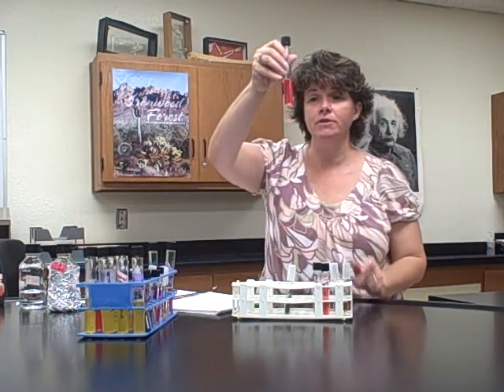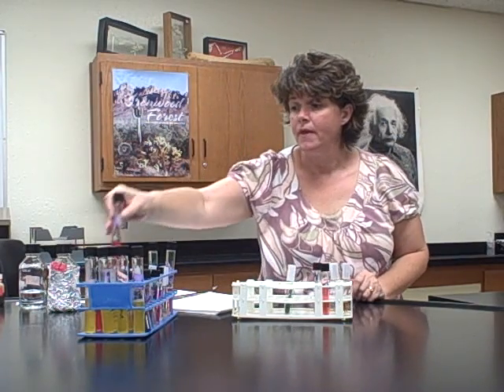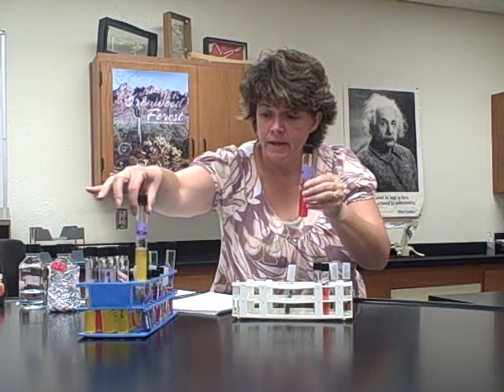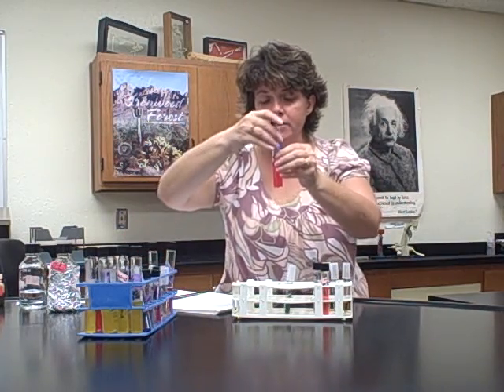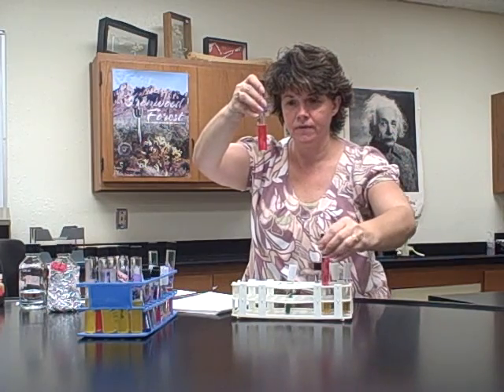Now this one does have a little bit of growth in it, so I could say, yes, there was growth, okay? Now, the next column says the color. So was the color red or yellow or pink? Some of them turned pink, okay, and that means something. So remember, this is uninoculated. So they started out with a reddish color, okay?